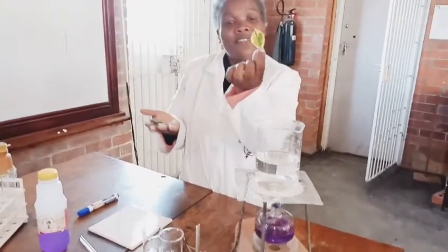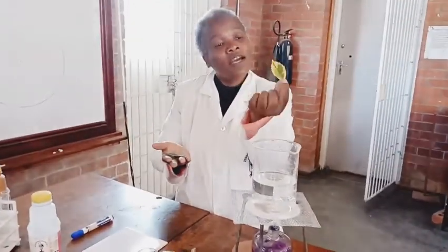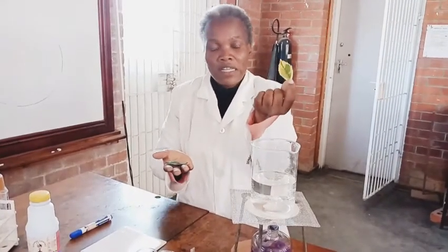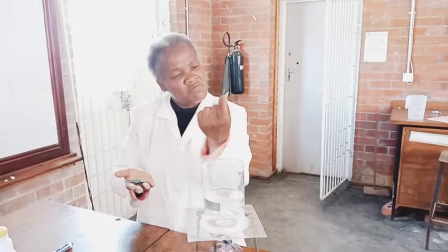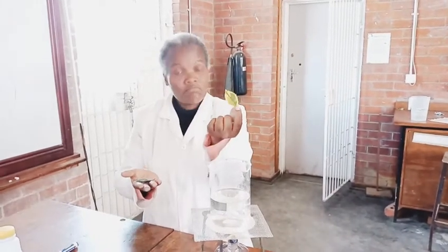This one is nicely colored - yellow and green. We refer to this as a variegated leaf. Remember chlorophyll is the green pigment, which means the yellow regions have something else. And this one is nicely green.